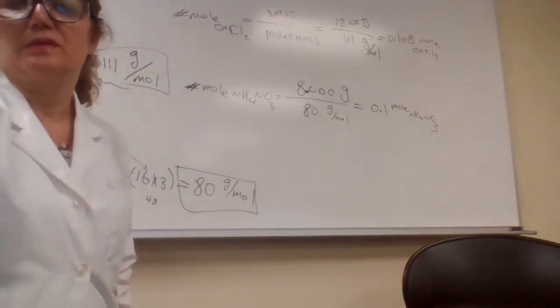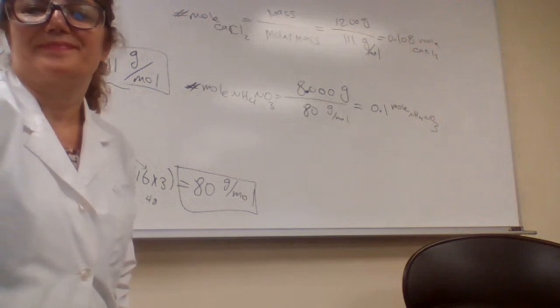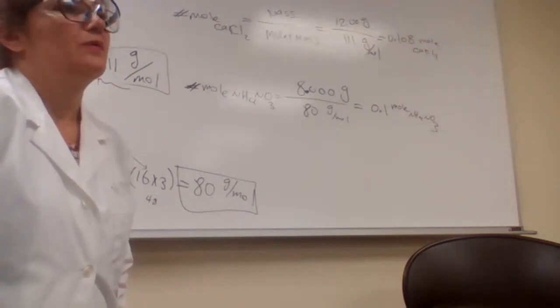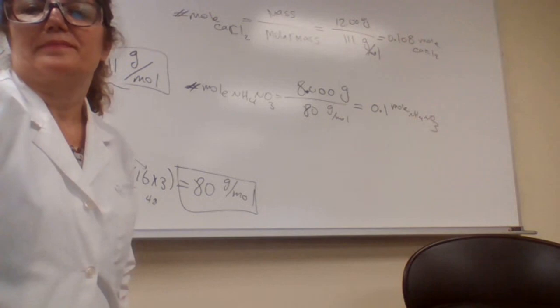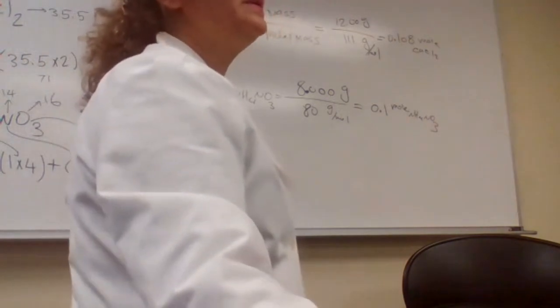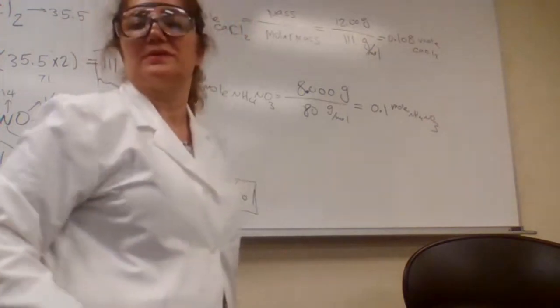Units for, yes. You got it. What is B? I don't know which B. Are you talking about part B of the experiment, heat of solution, or are you talking about B as the formula weight of the salt?